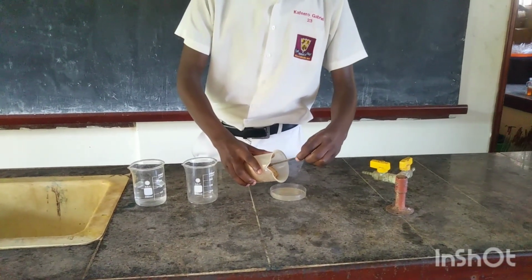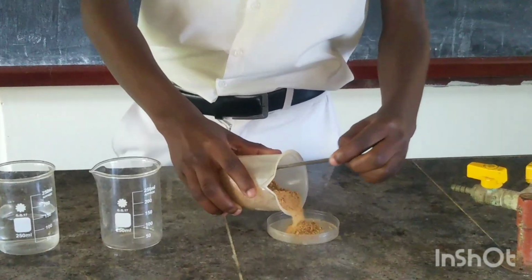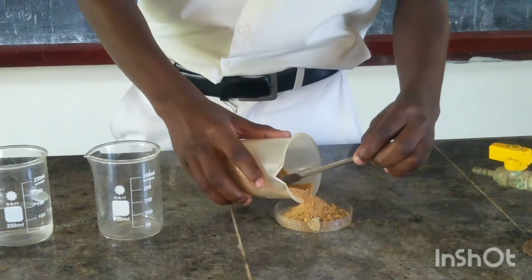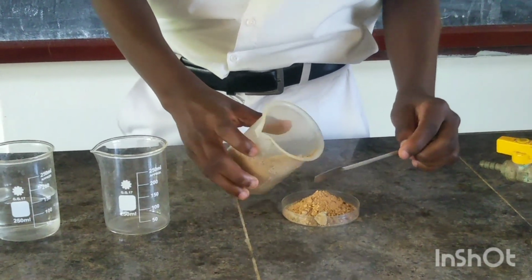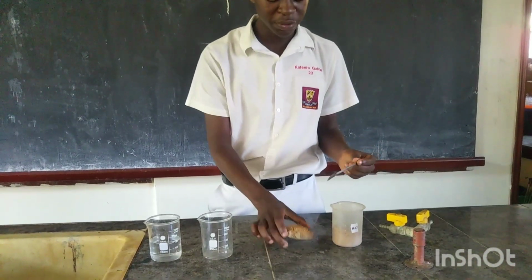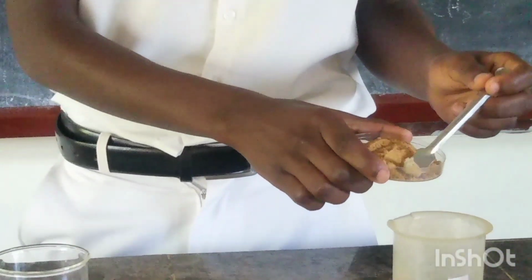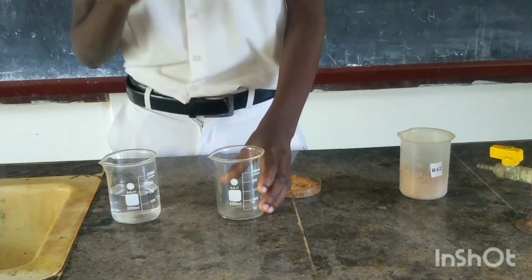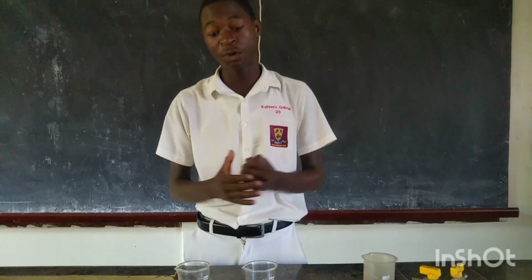I put the sand that I'm going to be using for my experiment into the petri dish. But as you see, this sand contains some big particles, including stones. Here I get my water, and remember, water is a substance that contains hydrogen and oxygen gases. So this water has two components, hydrogen and oxygen.